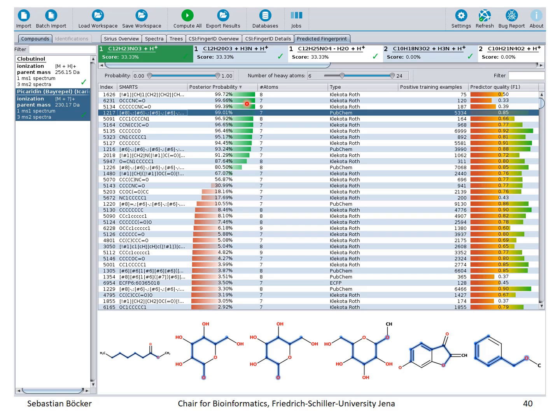So if it's very sure that this is true, it might be true, and we can't really do something about that in our automated classification. But you can now individually look at these things and decide for yourself whether or not you believe it. So you can be a little bit more cautious for this particular molecular property. Now, Kai has added a graphical representation of the SMARTS string, because as I said, SMARTS strings are not easy to read for somebody who is not used to them. It shows you a few examples of structures that contain this particular SMARTS string and even highlights it. It's not perfect, it's really just for you to get an impression of what this is about, so you can look at it.